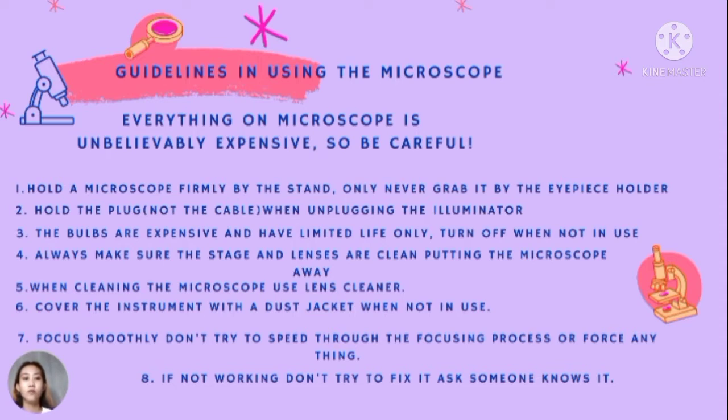Number 4. Always make sure the stage and lenses are clean before putting the microscope away. Number 5. When cleaning the microscope, use lens cleaner. Number 6. Cover the instrument with a dust jacket when not in use. Number 7. Focus smoothly. Don't try to speed through the focusing process or force anything. Number 8. If it is not working, don't try to fix it. Ask someone who knows it.